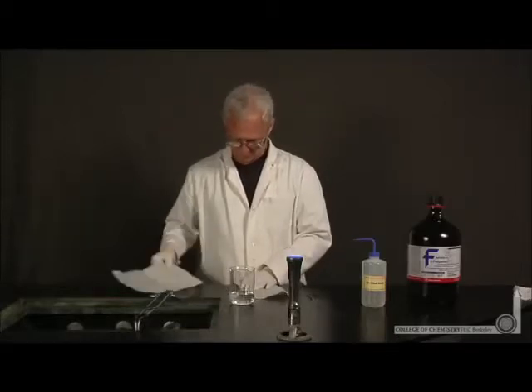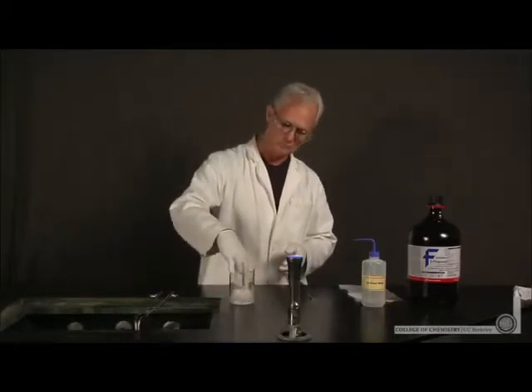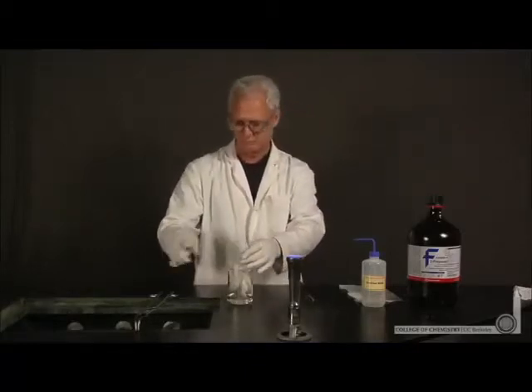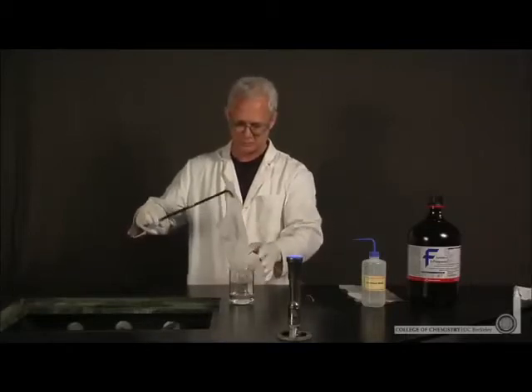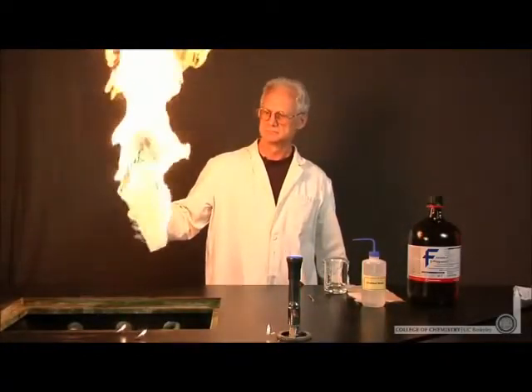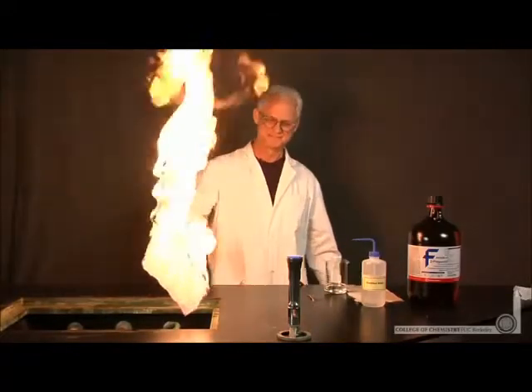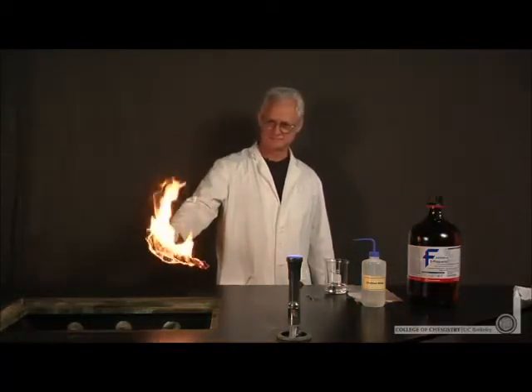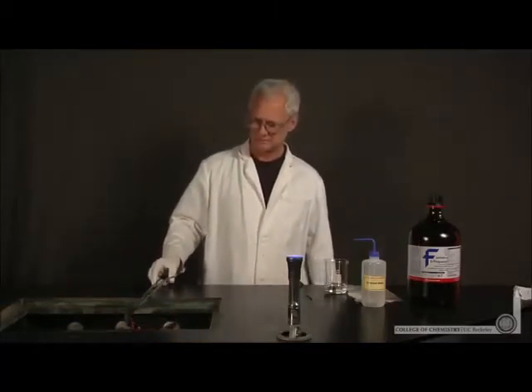So he'll soak this piece of towel in the isopropanol and he'll ignite it with the torch in front of him. Let's see how hot the isopropanol only towel burns. You can hold it with a pair of tongs, keep it away from his body, and ignite it in his torch. Isopropanol is a flammable liquid, and you can see he has to hold that fairly far away from him. That's a hot flame, and you can see it's going to burn the towel. So the temperature of that flame is clearly well above 500 degrees, the flash point of the paper, completely consuming that paper towel.